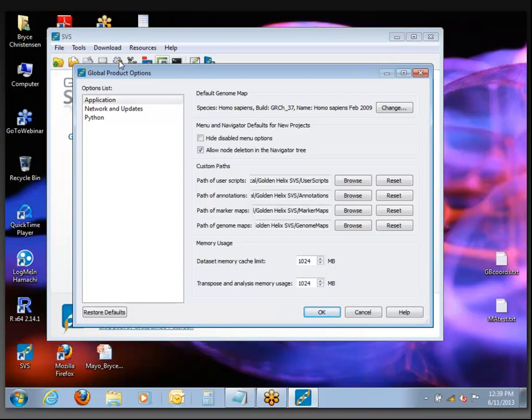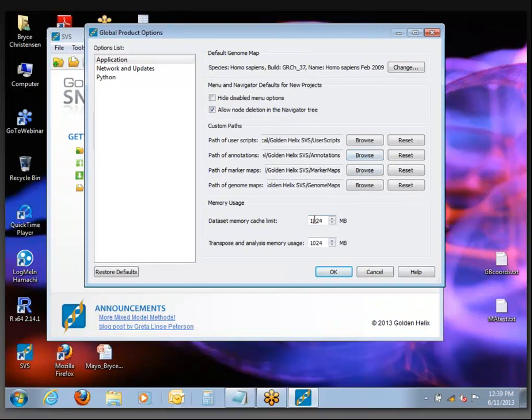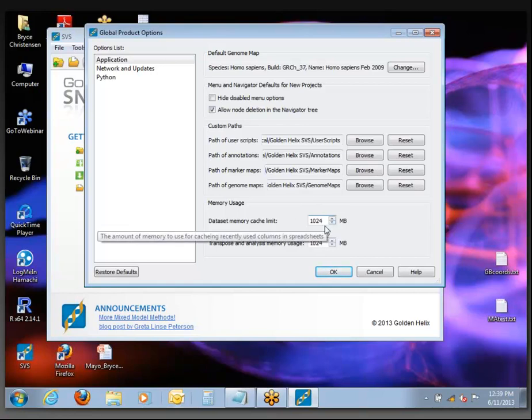For those of you who got the Windows bundle for the seminar today, do you see these same windows down here for memory usage or even specify a number, or does it just say medium, high, low? That's because the training bundle that we shipped out is based on the 32-bit version of the software. We have both the 32- and 64-bit version.